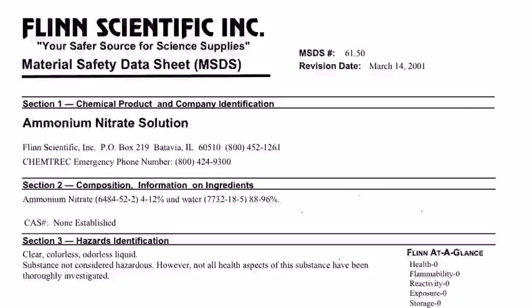What you see in front of you is a material safety data sheet, much like you will see for any of the chemicals we use in the laboratory. This one has been distributed by Flinn Scientific Incorporated, which is the company we use to get most of our chemicals for the chemistry lab.